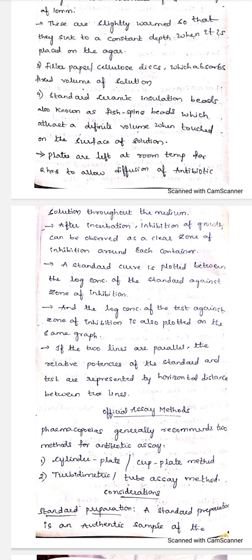So slowly the antibiotic solution will be passing from all the sites to the other ends of your Petri plate, and you can clearly see the zone of inhibition. So from the zone of inhibition only we can clearly say whether the antibiotic you are taking is working perfectly or not. So for that purpose you have to plot a graph.